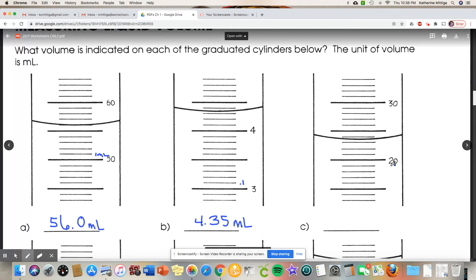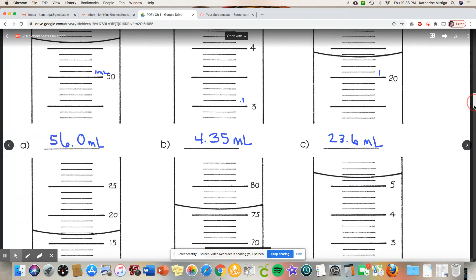This one we cannot go that far, we cannot estimate two decimal places because each of these are worth one whole milliliter. So 21, 22, 23, 24, so it's 23 point six. Now what if you say I think that's 0.5 or 0.7? That's fine because that last estimated digit is indeed that estimation, and we know that as chemists.